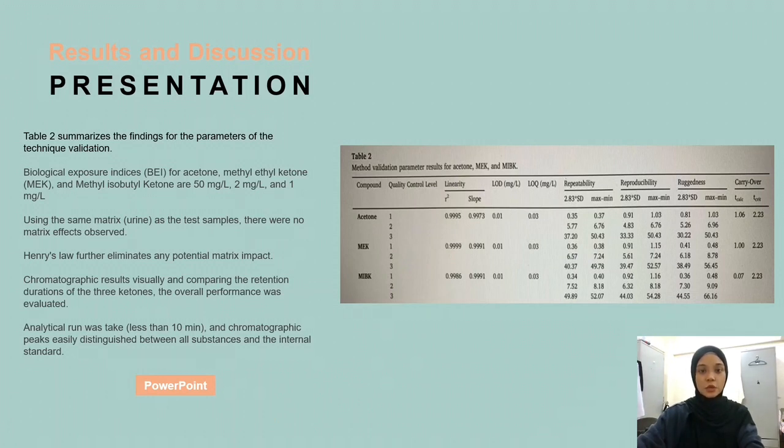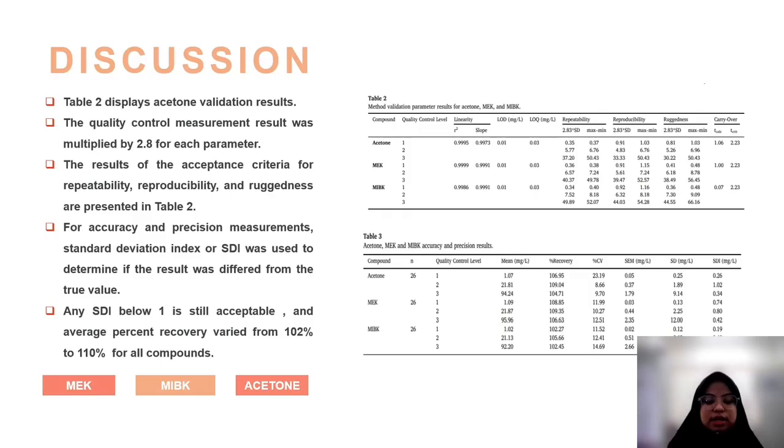By observing the chromatographic result visually and comparing the retention durations of the three ketones, the overall performance was evaluated. As evidence of the method's selectivity, the analytical runs took less than 10 minutes and chromatographic peaks were easily distinguished between all substances and the internal standard.